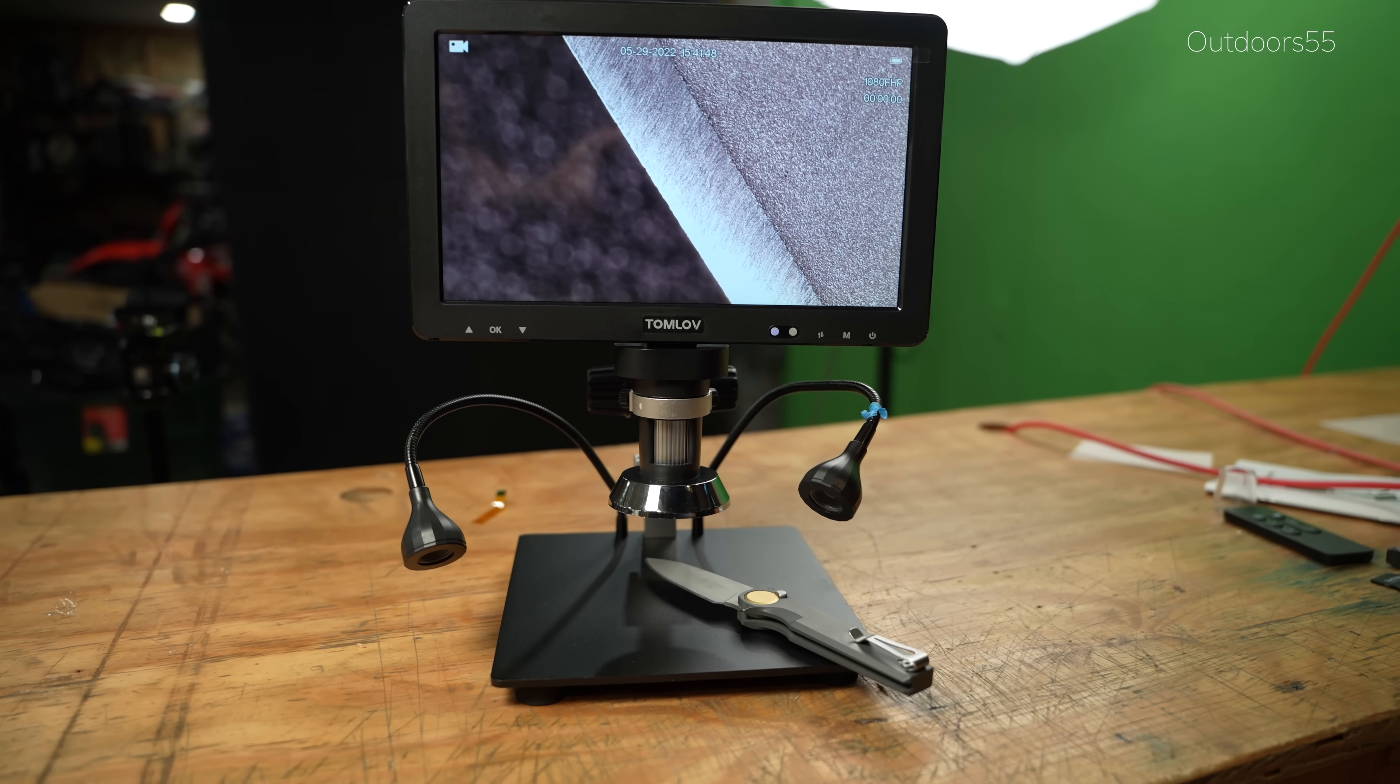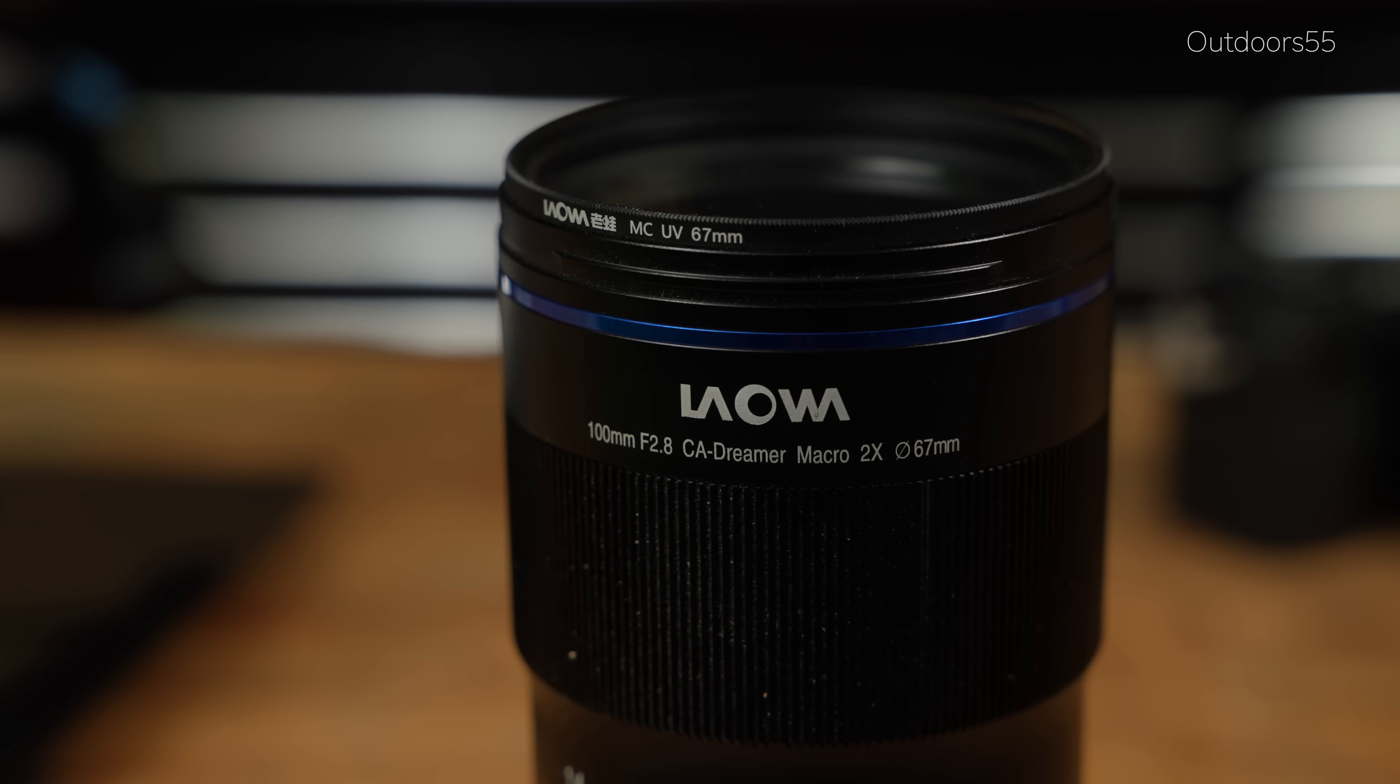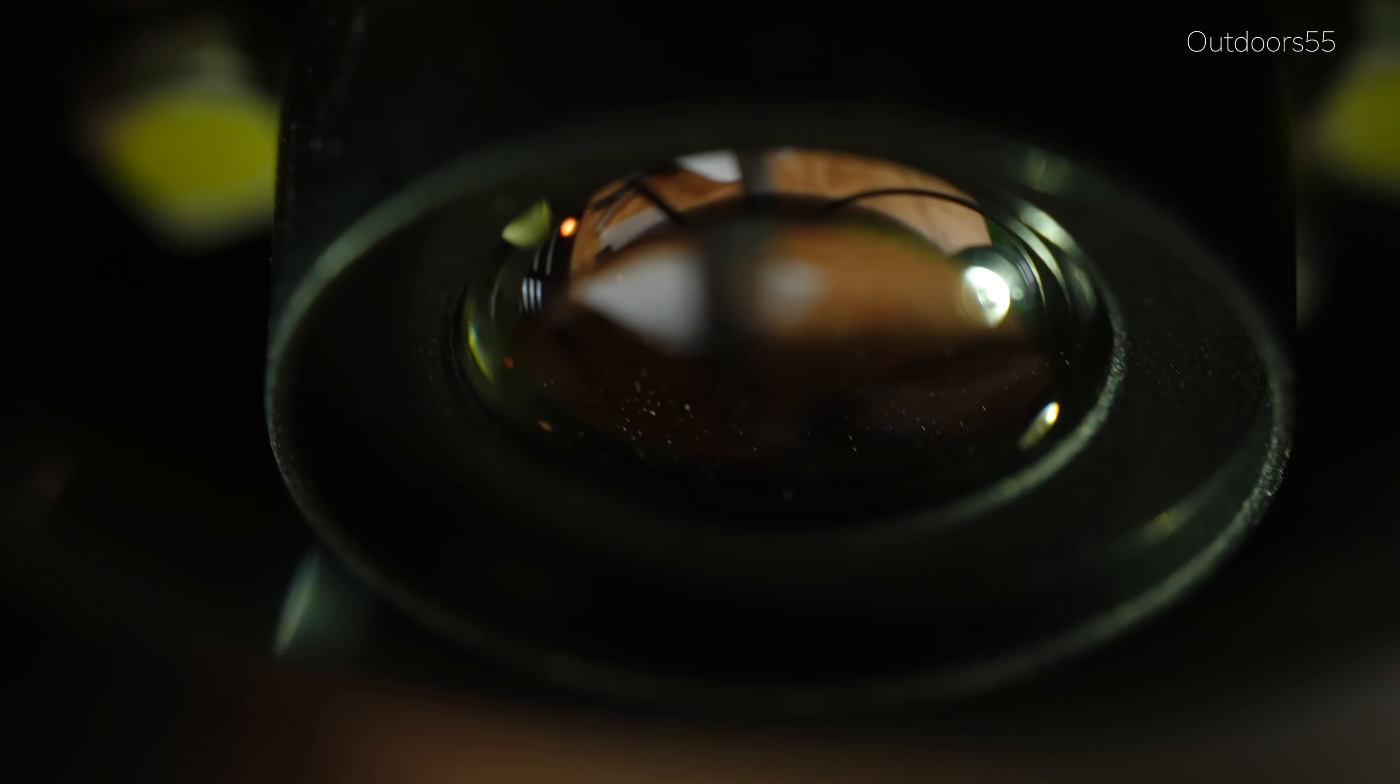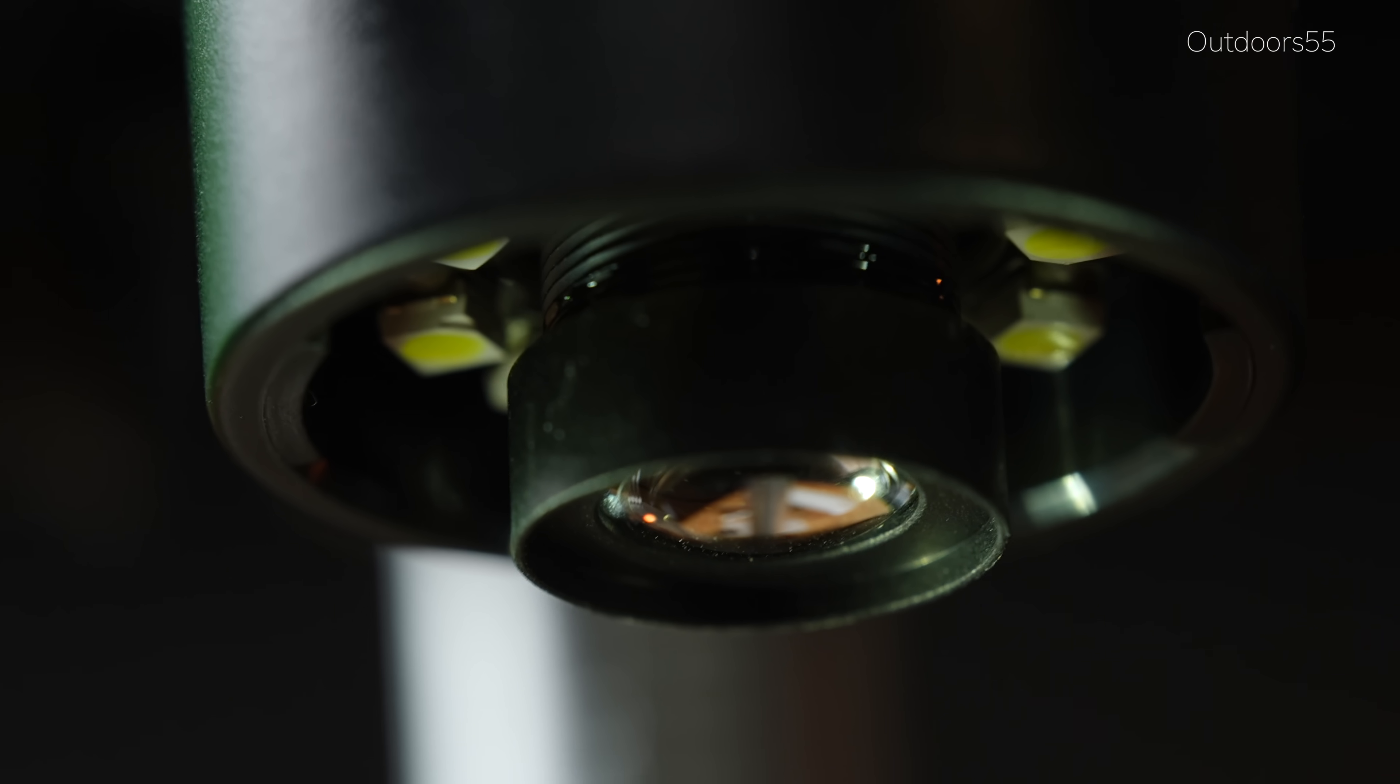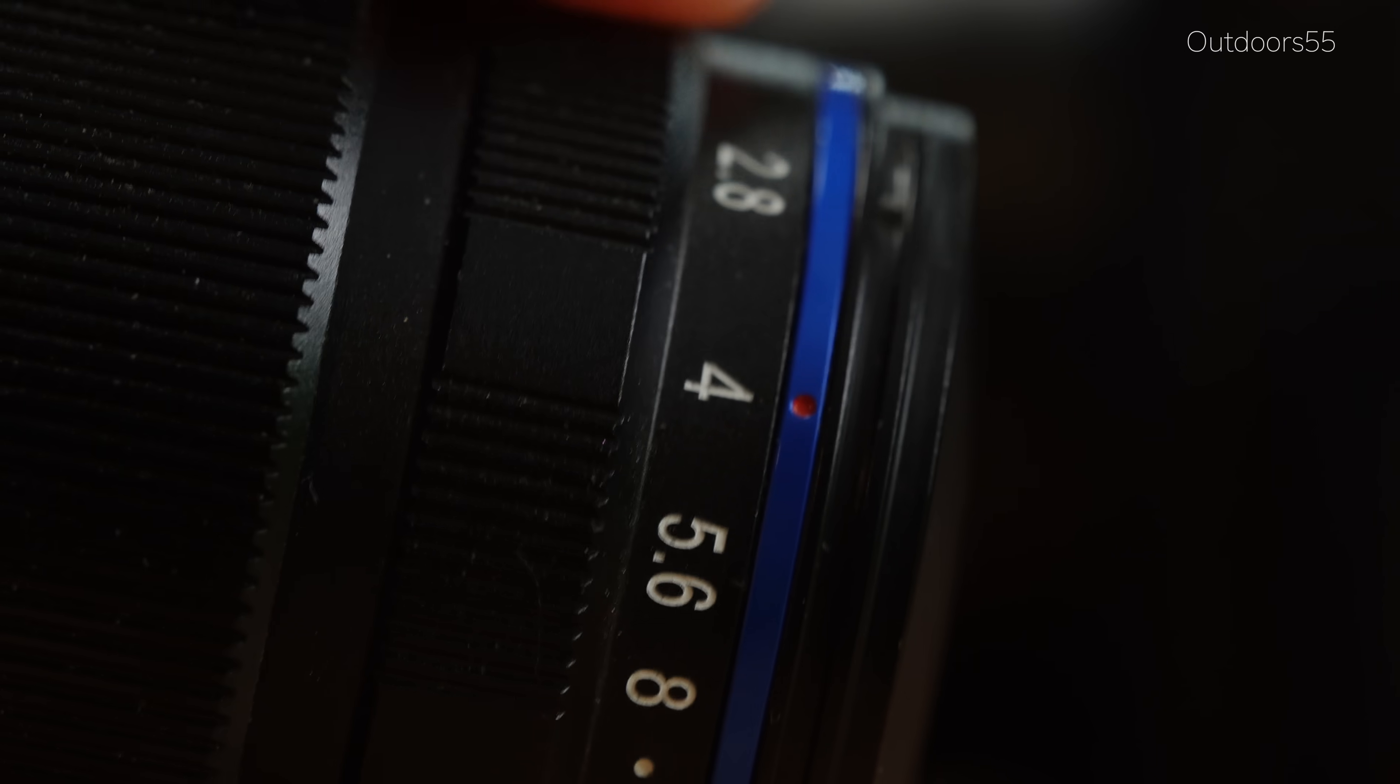Now another area where these cheap digital microscope struggle is something called depth of field. Now before I get all of the microscope and photography people coming out of the woodwork telling me that I'm glancing over a whole crap load of information in this video, realize that I know we're essentially doing that on purpose. We are just touching on some of these subjects. There have been books written on this subject because the actual lens, which we're not even going to discuss in this video, that the camera is viewing the object through has a lot to do with this. We're not even going to talk about it. Why? Because it doesn't matter for the purpose of this video. This video is specifically just to give you a general idea on why these cheap digital microscopes have the limitations that they do.